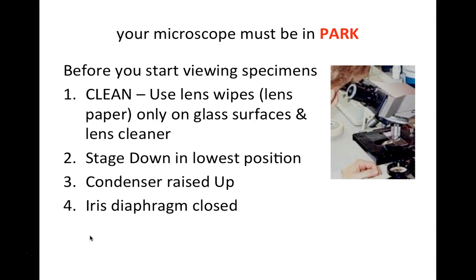Make sure you only use lens paper on the glass surfaces, and that the stage — the flat platform where we place our microscope slide — is in the lowest position. The condenser, just below the stage, should be raised up. The iris diaphragm should be closed to minimize the amount of light coming from the illuminator. We always want to start with light intensity low and then increase it as needed.